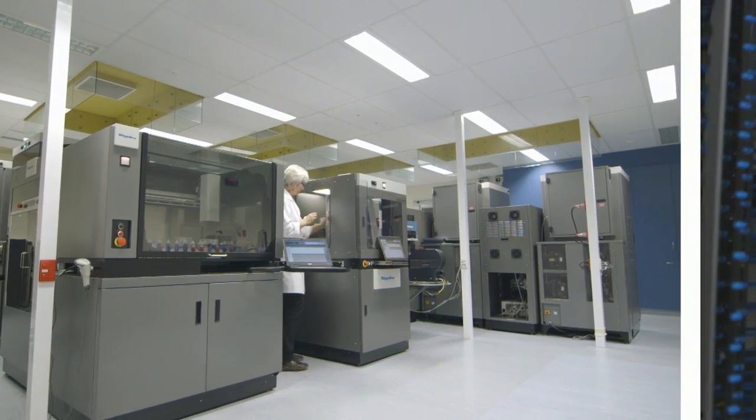Here at the Monash Macromolecular Crystallisation Facility, we use a fully automated robotic system to produce crystals.